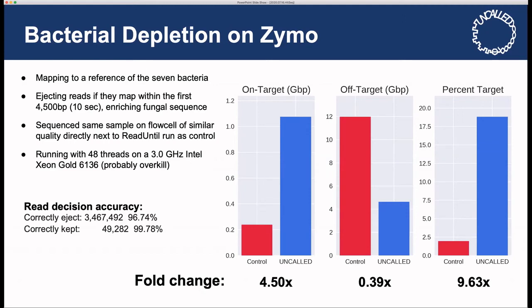So I think this is an amazing result where, thanks to purely software methods, we can skew the distribution of the molecules and skew the distribution of the data that are actually coming out of the instrument. There's just endless opportunities for this.